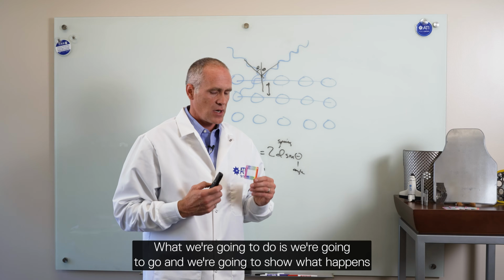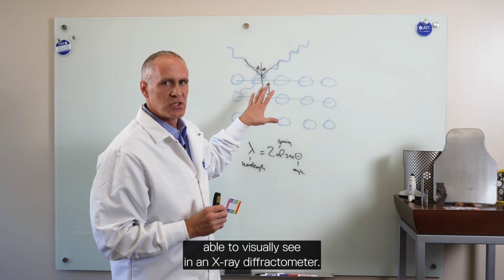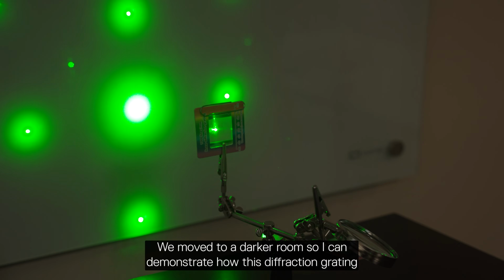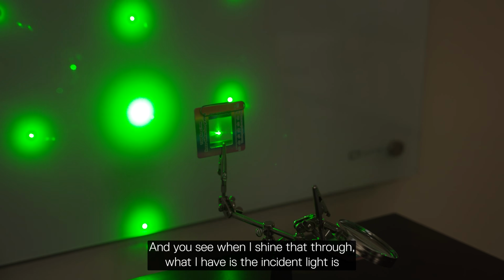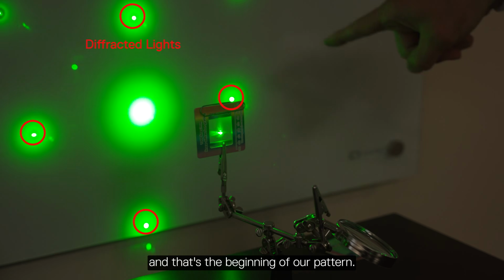So what we're going to do is show what happens and how you can visually see with this setup what you would not be able to see in an X-ray diffractometer, and we'll come back and talk a little bit more about the math. So we moved to a darker room so I can demonstrate how this diffraction grating works with the laser pointer. When I shine that through, the incident light is the big one in the center where there's no diffraction, but you can see the points off to each side which are diffracted from this laser, and that's the beginning of our pattern.